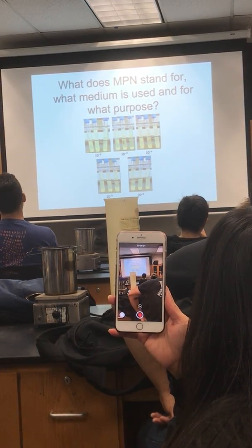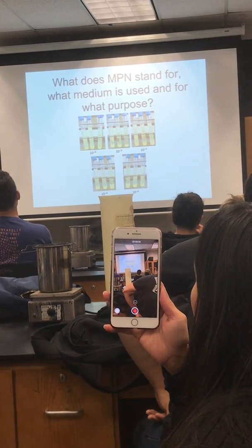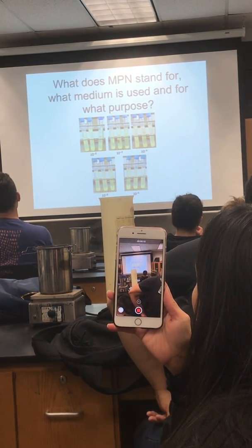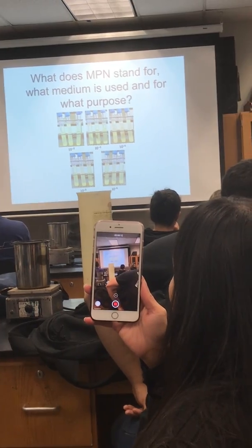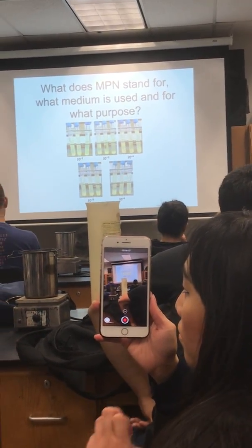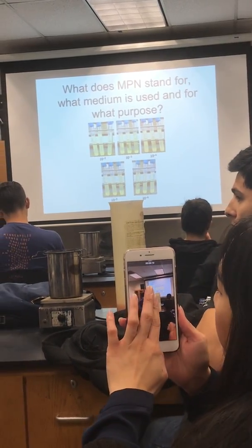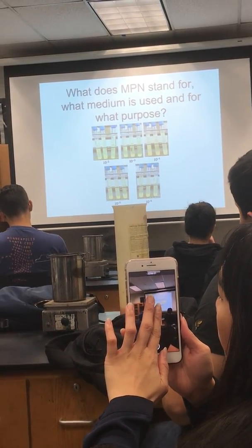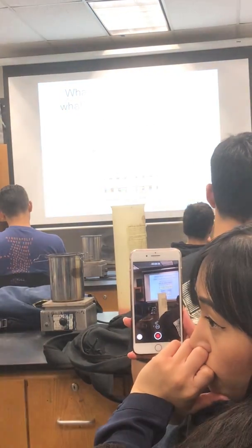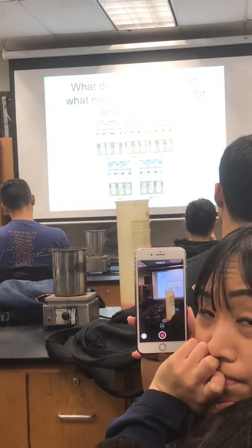The MPN test was what called what in the water quality test? Remember there were 3 parts? It was the presumptive test. We were doing the presumptive test for lactose fermenting organisms, okay? So we were using lactose broth. We started with double strength because we were adding a lot. It makes it single strength, but it's lactose broth, okay? There's no indicator dye in this.